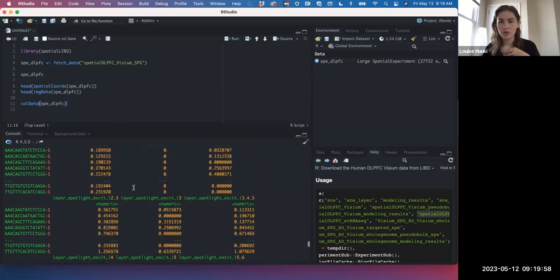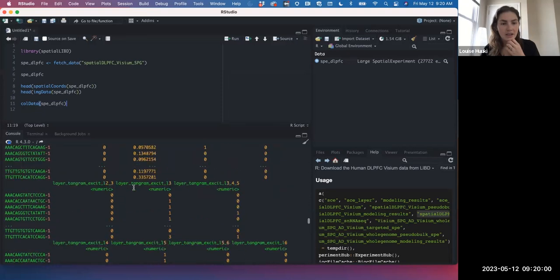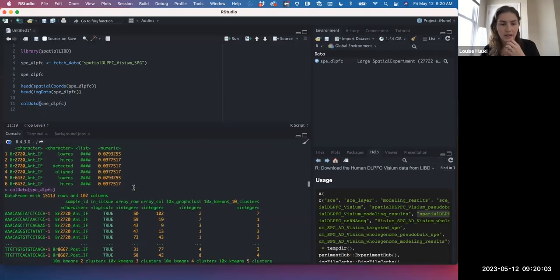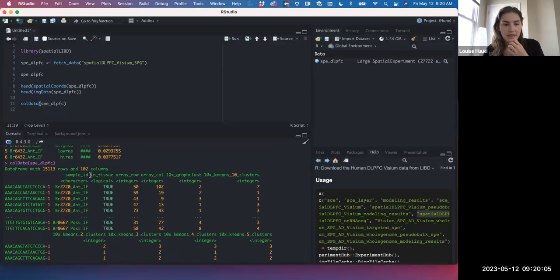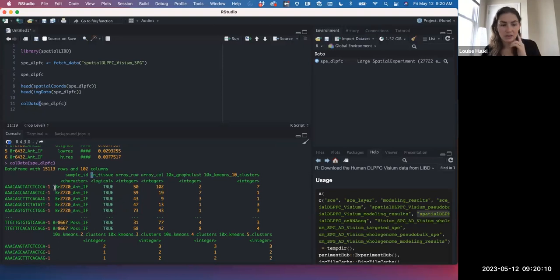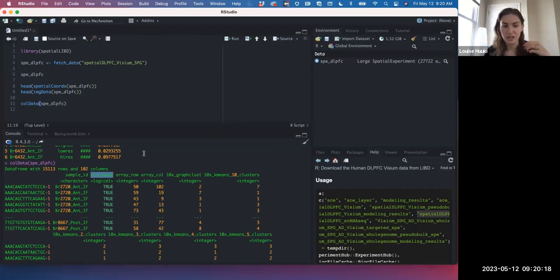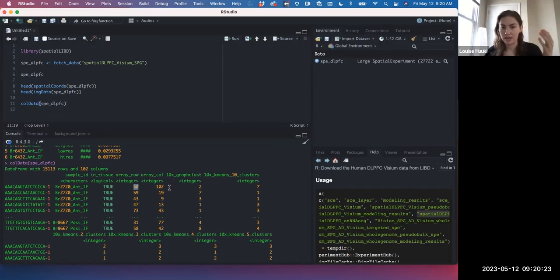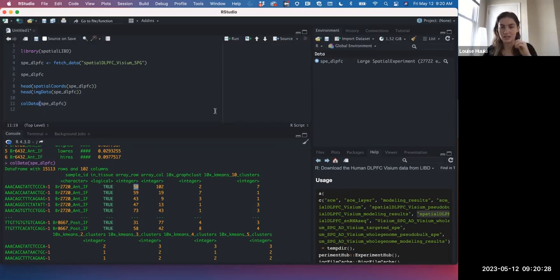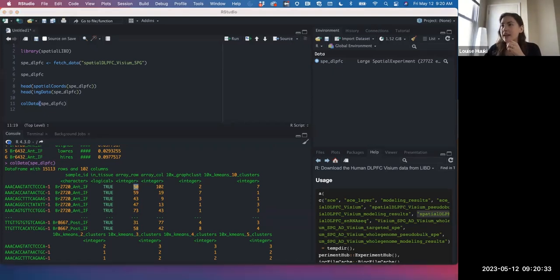Looking at the colData, for each row — which represents a spot — a spot either gets in_tissue TRUE or FALSE. In this object, all are already TRUE since spots outside the tissue are filtered out. Each spot also gets an array_row and array_col, which goes back to the Visium array frame and the locations of all those spots.